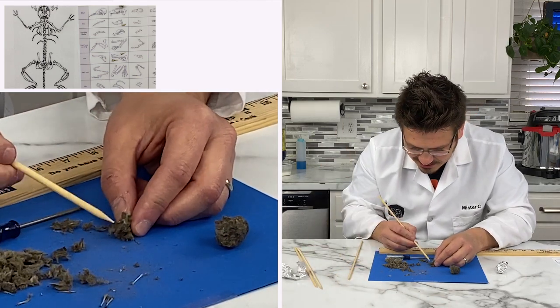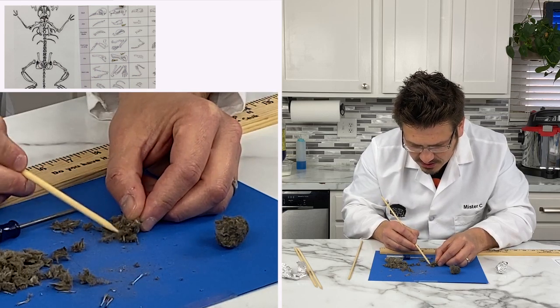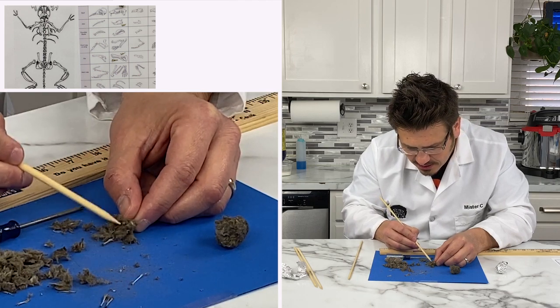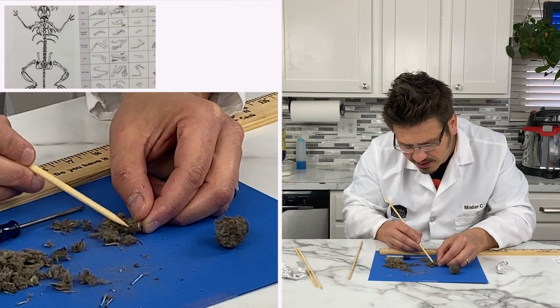All right, here we go. Let's see what else we got in here. There's something. It looks like a couple of... So there's all these little rib bones that are really hard to see. I'm trying to be gentle so I don't break anything.